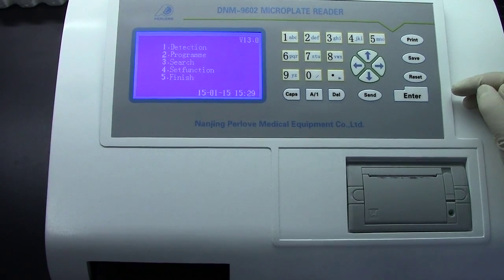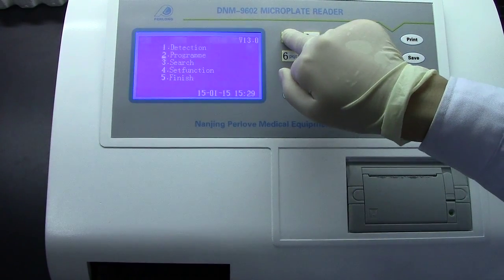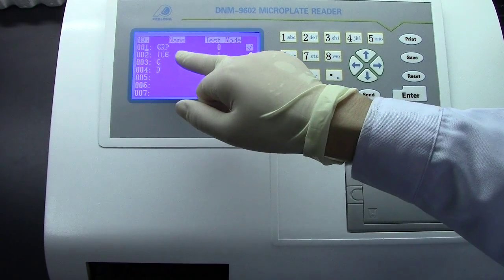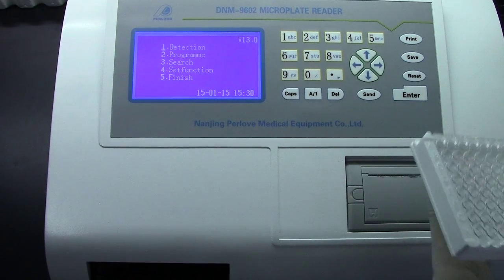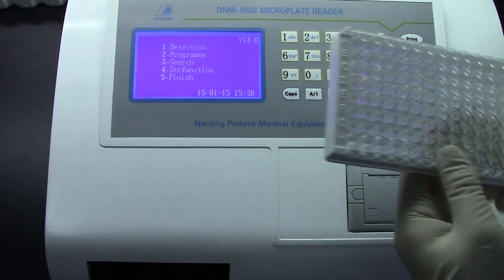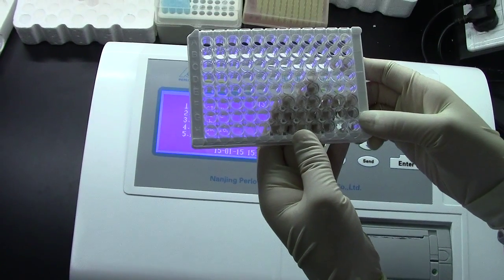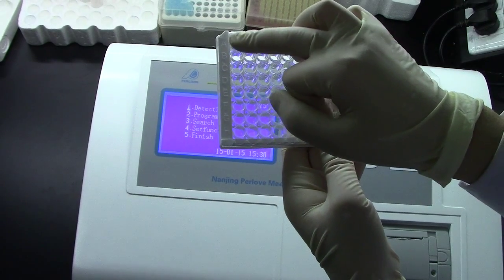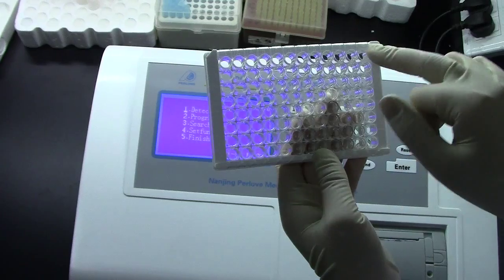Now we will check the program tool. Press 1. You can see IL6 is here. Let's detect the microplate. The microplate is 96 wells. The column from A to H, the row from 1 to 12.